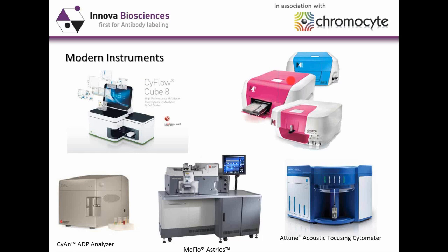And actually, although the development of the machines has gone down the route of making these instruments extremely accessible to the user, the ease of use has to be treated with caution, because it doesn't replace the need for understanding the principles behind flow cytometry and the need for the appropriate control experiments and control samples within each of those experiments.